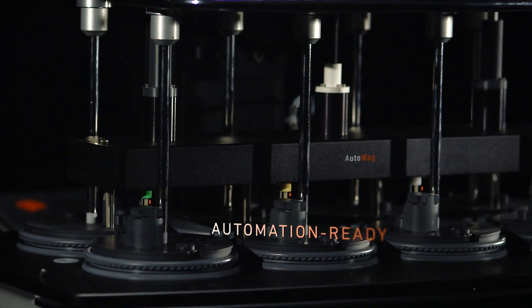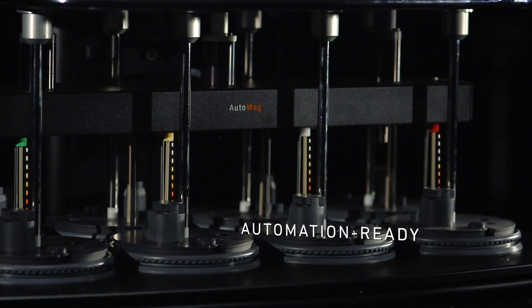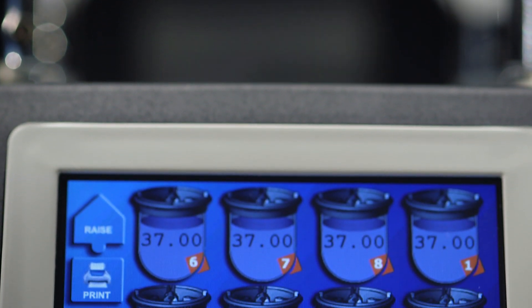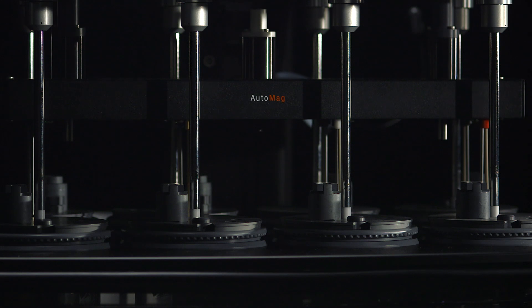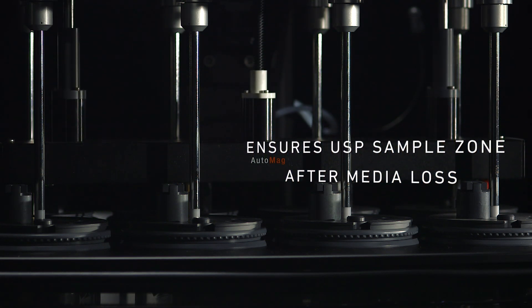It is automation ready to perform tests faster and more reliably. The AutoMag and SuperMag have powerful programmability to allow users to specify probe depth at each sample time point, ensuring USP sample zone requirements are maintained after any media loss.